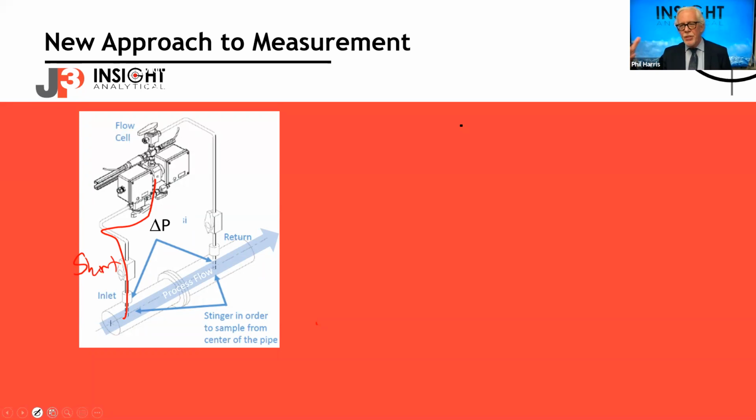So it means if we do all of our measurements under the same physical conditions as the process, we shouldn't get any phase changes. So now we don't have to worry about, well, I took my sample of natural gas liquids, but in bringing it over to the analyzer, it all started to bubble and foam. That's not good for us. We don't want that to happen.